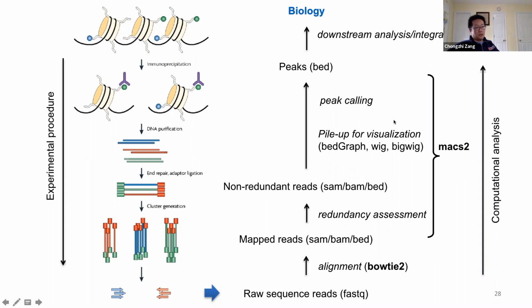We'll also be mentioning the QC quality assessment in this step. After we obtain the peaks that represent the regions of protein-DNA interactions, the quality assessment of this step will be able to tell whether the ChIP experiment worked well or not.